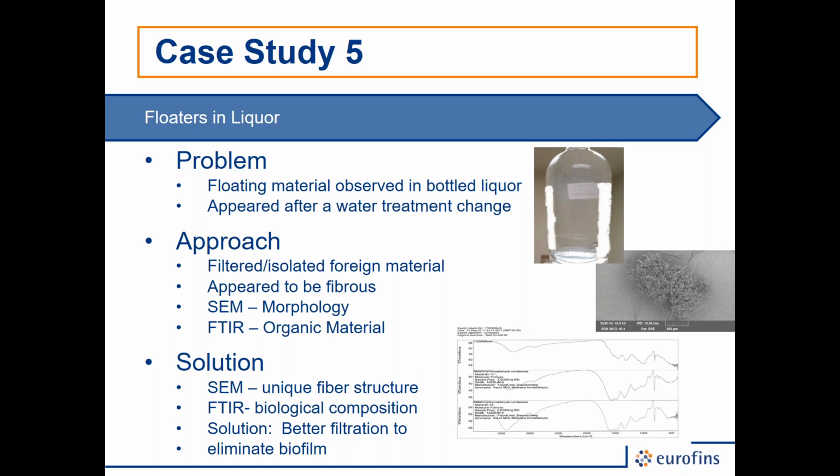We isolated it, took a look by light microscopy, but it didn't look very interesting that way. It didn't have enough detail in the light image to determine anything. You put it under the electron microscope, and that's the image you see in the middle. And it has this very distinct structure to it. That made it very interesting and gave us some ideas about what might be going on because of that structure.